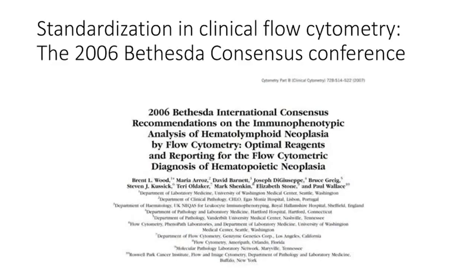Now, before the EuroFlow group came out with its tubes and protocols and so forth, there was a prior effort at standardization, and that was published in a series of articles in Clinical Cytometry in 2007, one of which is shown here. But the goal was a little bit different.